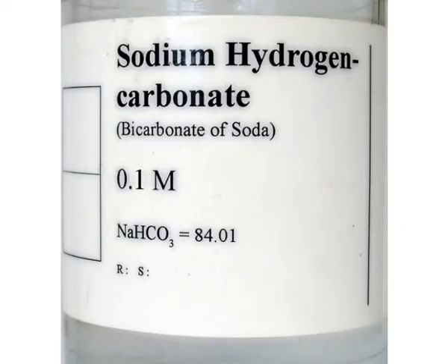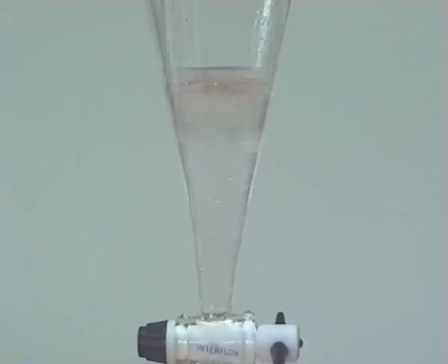Aqueous sodium hydrogen carbonate solution was added to remove acidic impurities and effervescence was seen. The pressure was released regularly whilst shaking the funnel.